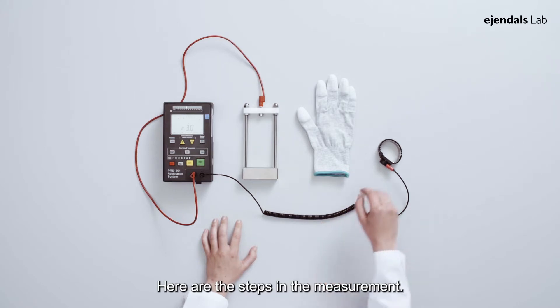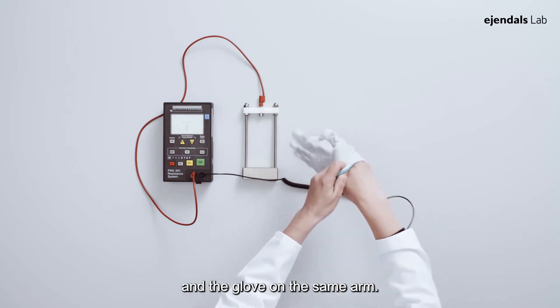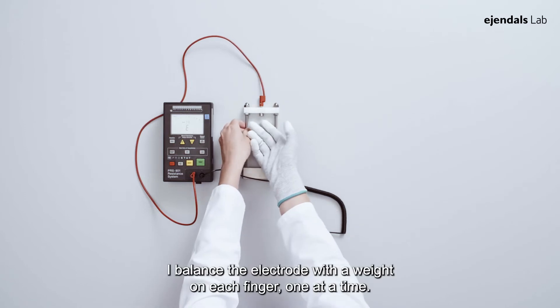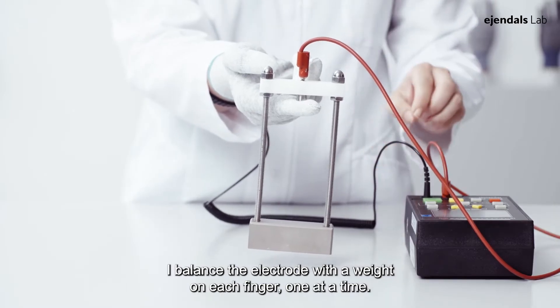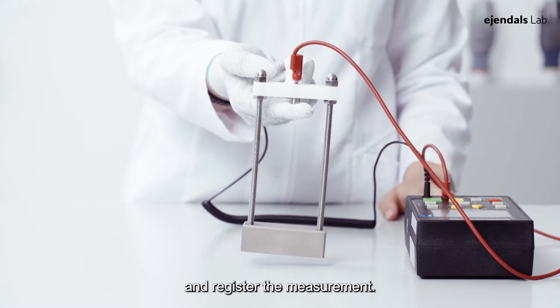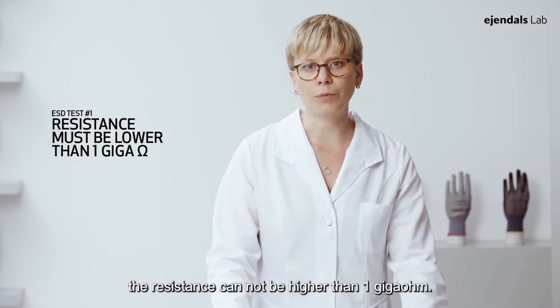Here are the steps in the measurement. I put on the wrist strap and the glove on the same arm. I balance the electrode with the weight on each finger one at a time. I press test and register the measurement. To pass the test, the resistance cannot be higher than 1 Giga Ohm.